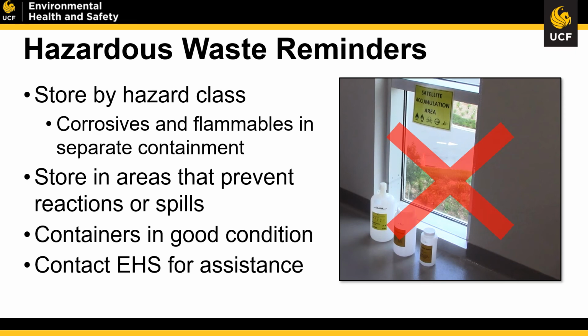If for some reason you need additional guidance on how to properly store your waste, please reach out to the Environmental Health and Safety Department and we'll be happy to assist you. As you fill out your labels and adhere them to the containers, please fill them out as chemicals are being added, and please give us the actual concentrations that you believe those compounds are and their chemical names. We want to make sure that if someone enters your space and is introduced to your hazardous materials and is not familiar with them, they are able to identify what those hazards are.